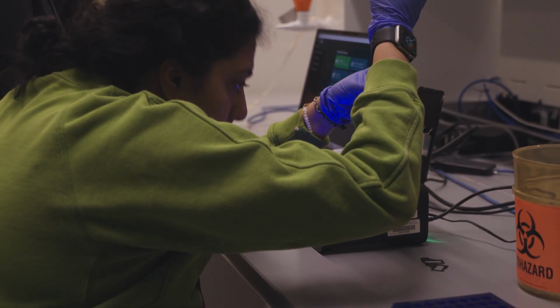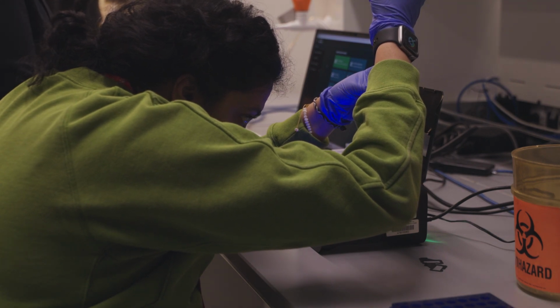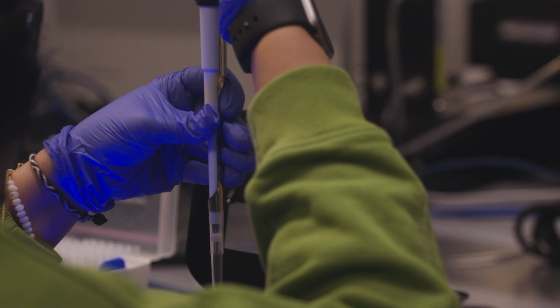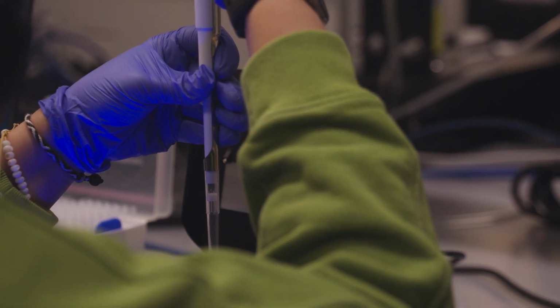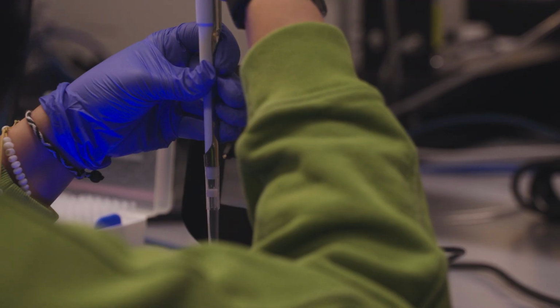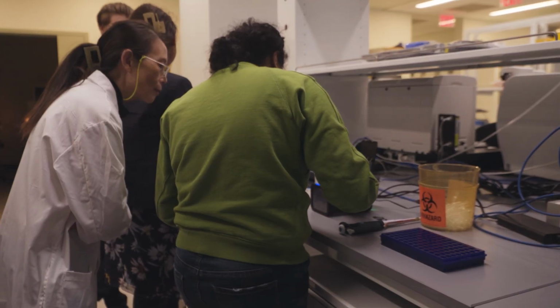And then we are going to start the sequencing run. It says here as well how to do it. It also outputs the electrical signal so we can base call later as well. Is that right? Absolutely. For this protocol, whatever we shared, it is for cfDNA, right? They are saying to use HAC, high accuracy calling, so I think HAC should be enough.